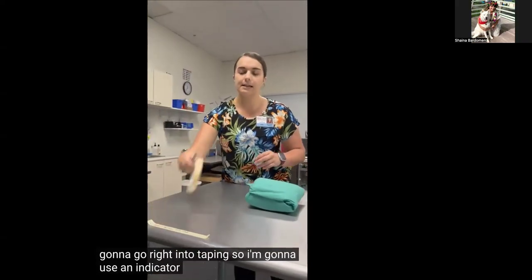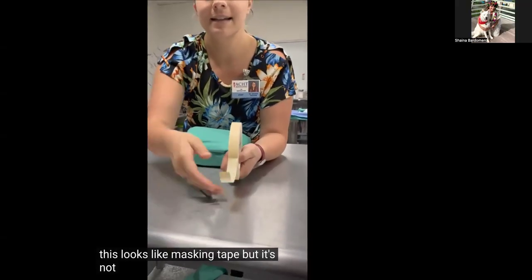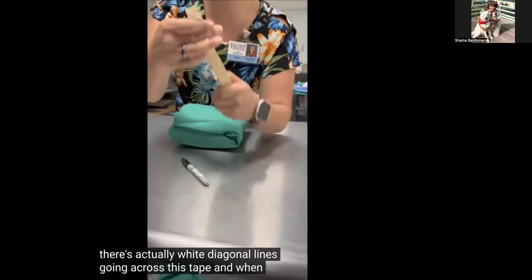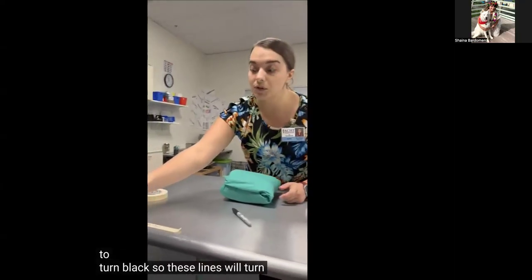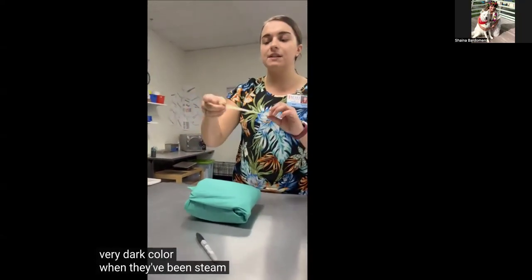So I'm gonna use an indicator tape, and you'll notice this looks like masking tape, but it's not. There's actually white diagonal lines going across this tape, and when it goes through that steam autoclave, it's going to turn black. So these lines will turn a very dark color when they've been steam penetrated.